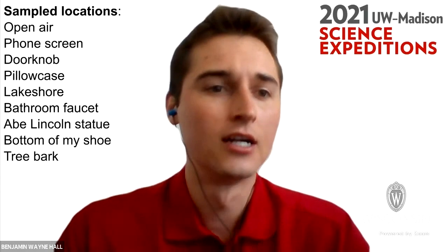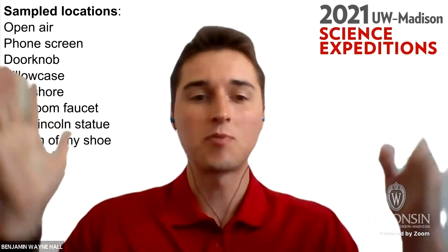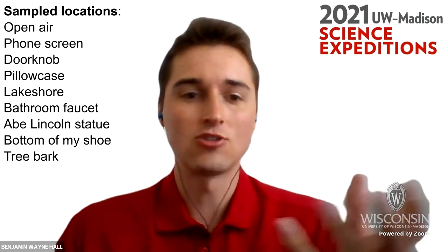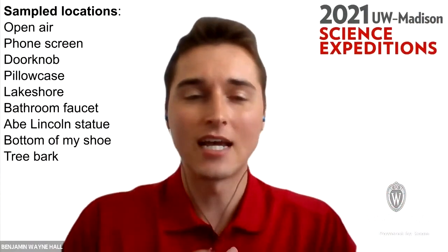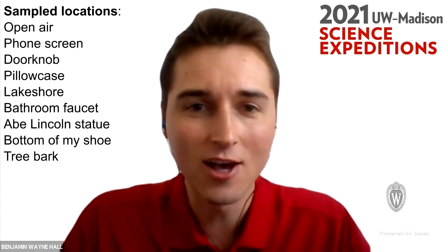And then open air, like the viewer said, is a very open space for bacteria to be distributed. So maybe just by leaving my plate out and trying to let some bacteria land on the plate, the bacteria were so far apart that none of them happened to end up on my plate, or very few. So I think that's also a great prediction. So thank you for sharing that. Any other predictions or explanations, Brianna?